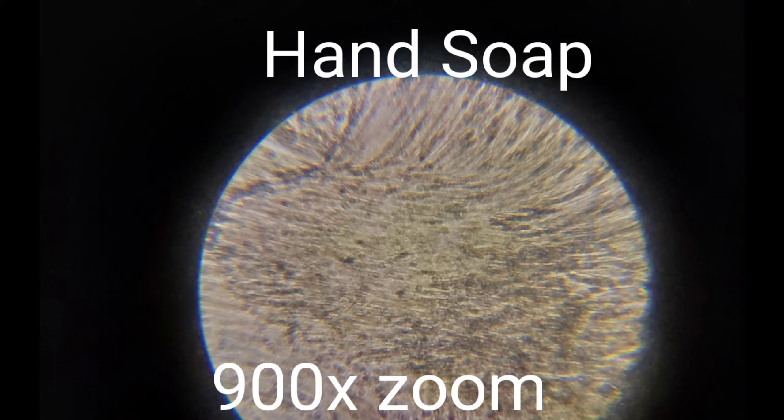So now we have hand soap, which as you can see, if you go back in the video and then replay, it's a little bit different than the water, but that also has regular bacteria, which is still fine for you.